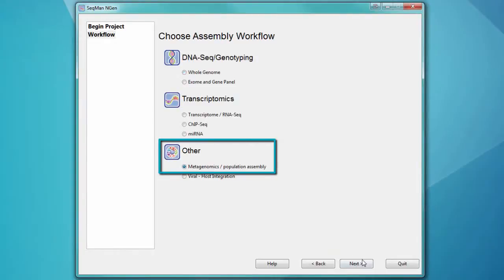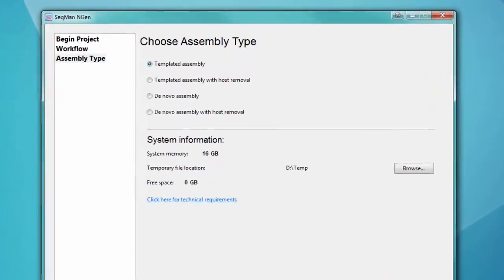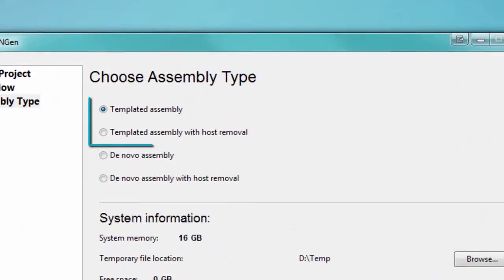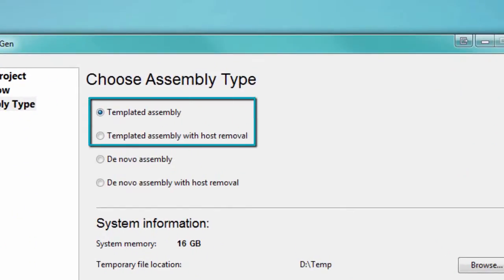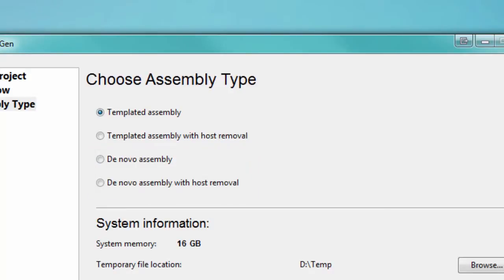The metagenomics workflow in LaserGene allows you to assemble metagenomic sequencing data against a template sequence or reference database, or de novo without a reference set, and gives you the option to remove host DNA from the data.